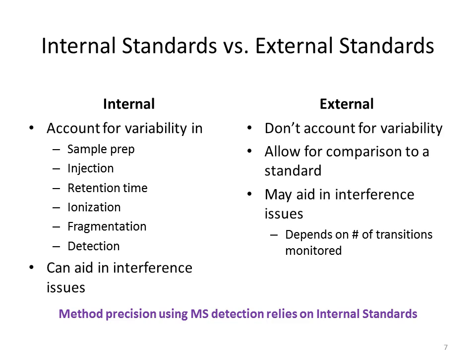Okay, so we've got differences between internal standard and external standard. I always have been using internal standards. That means I take my standard, I spike it into my sample, and it's analyzed at the same time. External standards are something that people use.